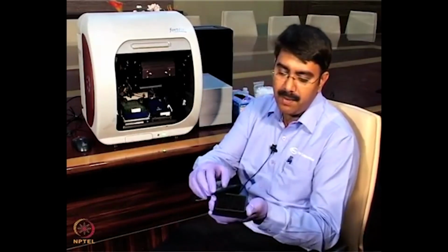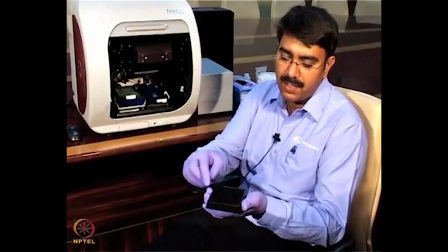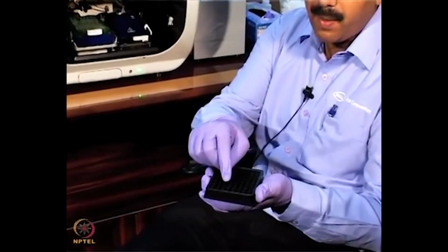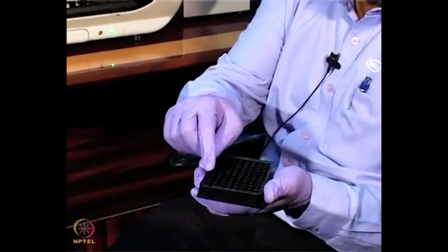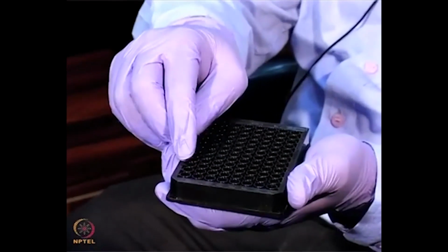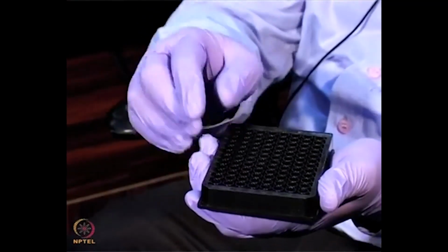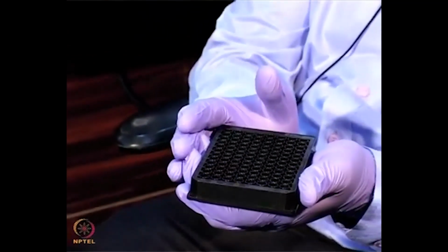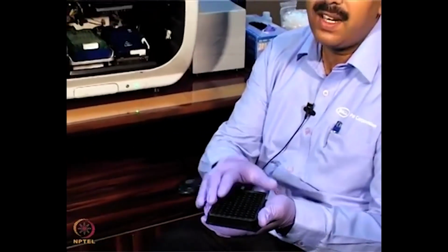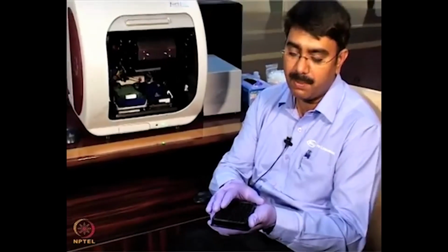This is the plate map here. This is the buffer, the first column, and in the second column I am going to put the 10 microgram per ml concentration of biotinylated protein A, and in the third column I am going to put buffer. It will be useful for washing off the unbound biotinylated protein A, and also this well I am going to use for the dissociation purpose.